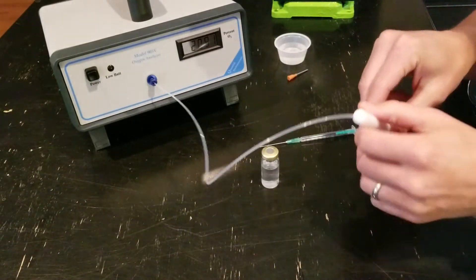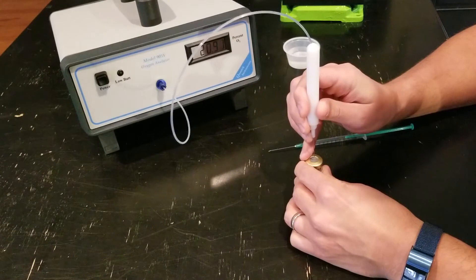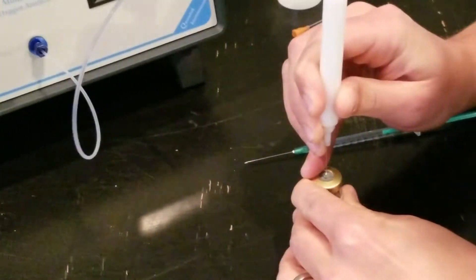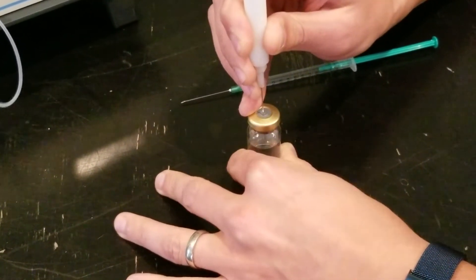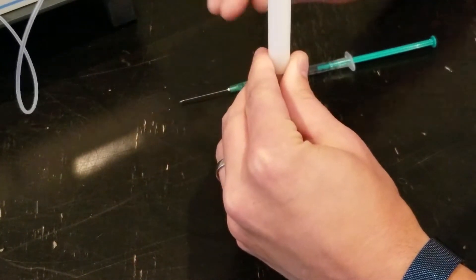Then take the sample probe and carefully puncture it through the top of the septum, making sure not to go into the product. You can look down and see exactly how far you're going in — and we're through the septum there. Now we're just going to hold that in place.